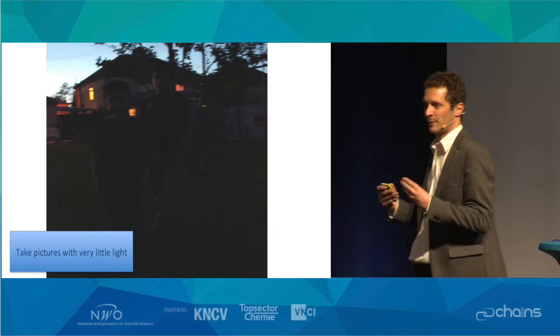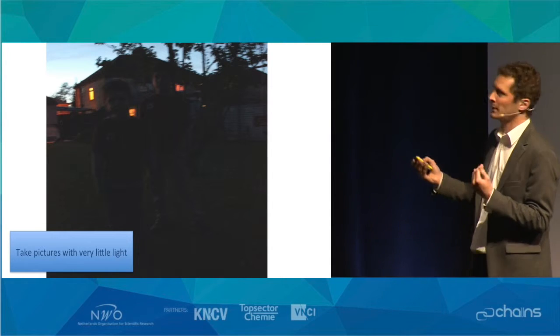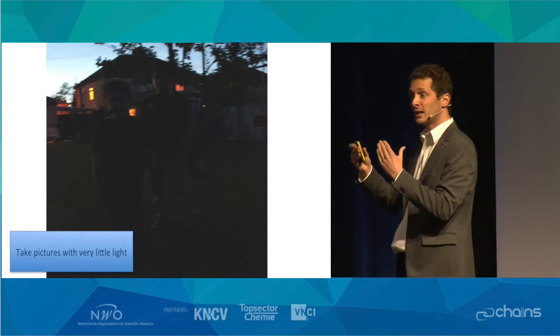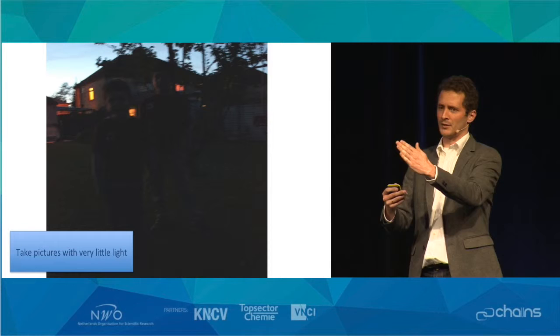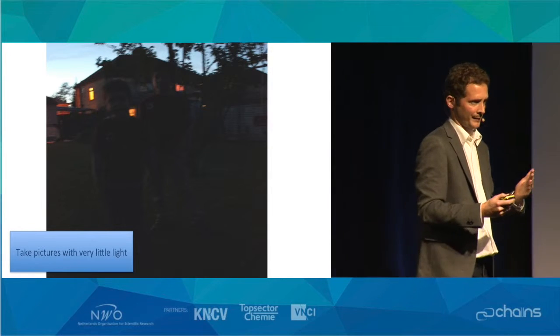Now imagine you have a better digital chip, which is more sensitive to the light, and you can just make pictures which are just a little bit better. But this difference could just be the difference between being able to say this is a front view or a top view or a side view, and thereby you can put that 2-dimensional transform in the 3D transform and start to average out noise by just adding in more data.